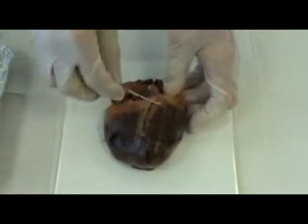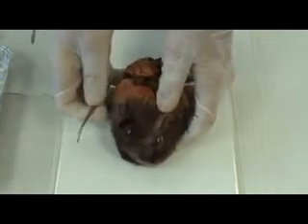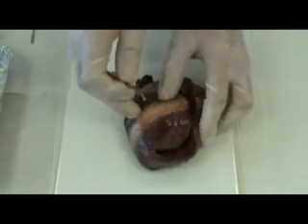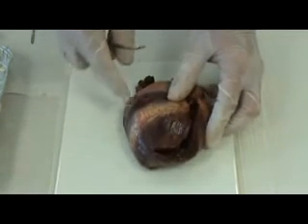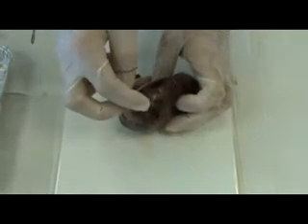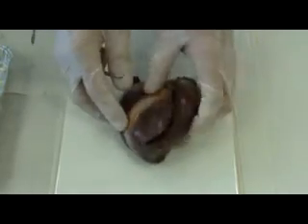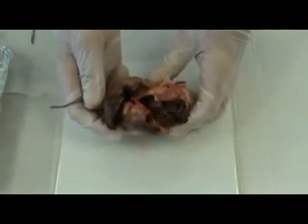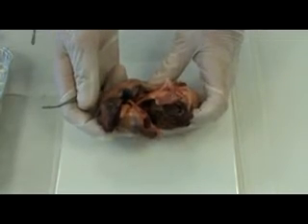So we've got the anterior view. Turn it over. Posterior view. And the apex is the inferior view. And the top part of the heart is the superior view.